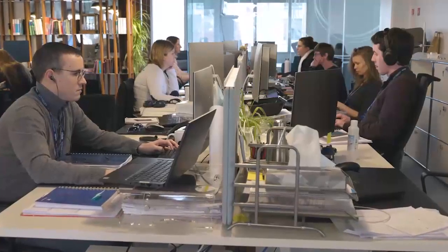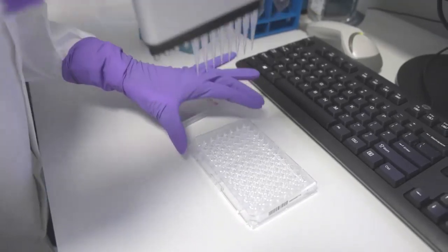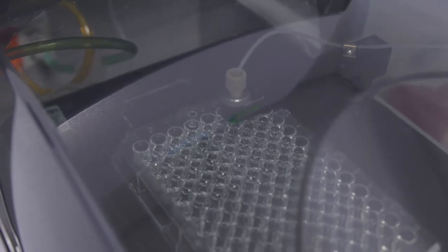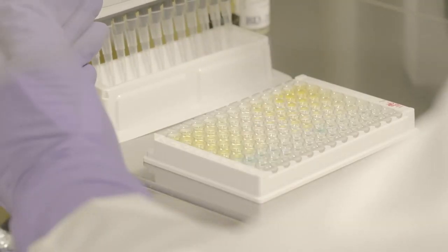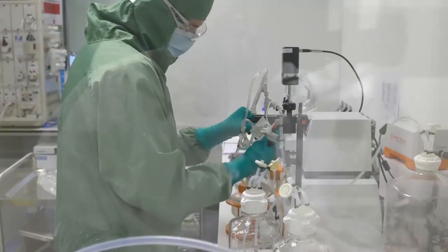In parallel to the development of the process, we are developing all the assays that will be able to monitor and characterize the quality of the UCAR T batches. Among others, we are developing identity, safety, potency, and purity assays, and these assays will be developed and pre-qualified according to the guidelines from the regulatory agencies. All these assays are performed using flow cytometry, and one of the tasks of my team is to put in place the antibody panels that will allow this characterization. Eventually, this assay will be transferred and implemented in the QC lab at Raleigh in a more controlled and qualified environment. This assay will be finally qualified and validated, and then will be used in routine for the release of the GMP batches for clinical use.